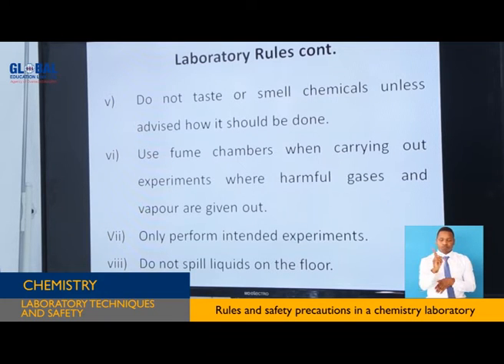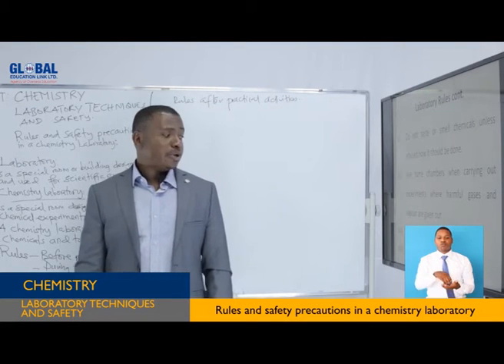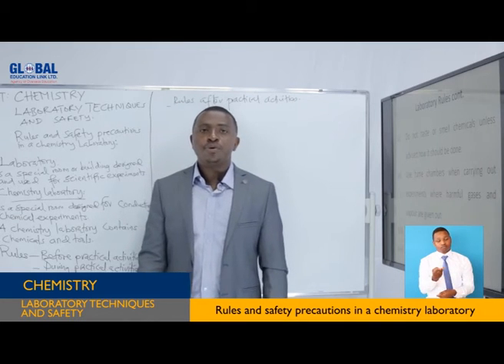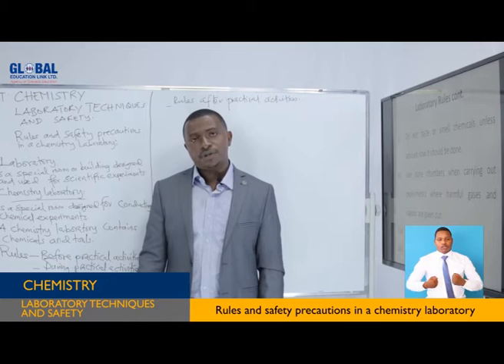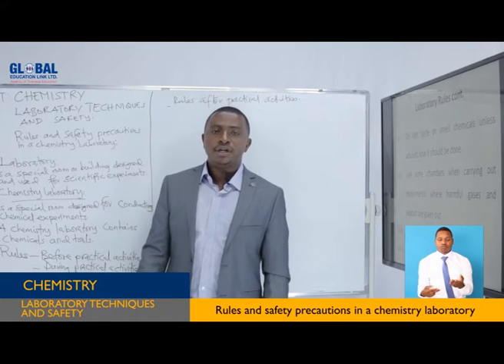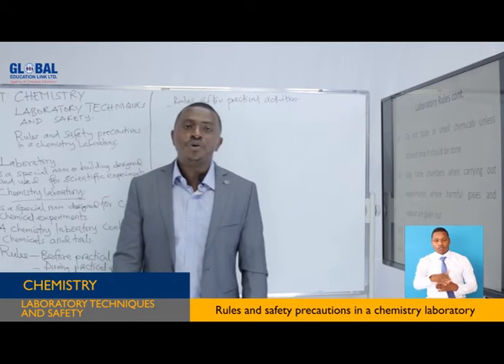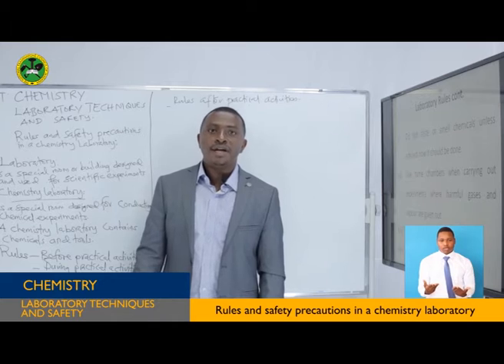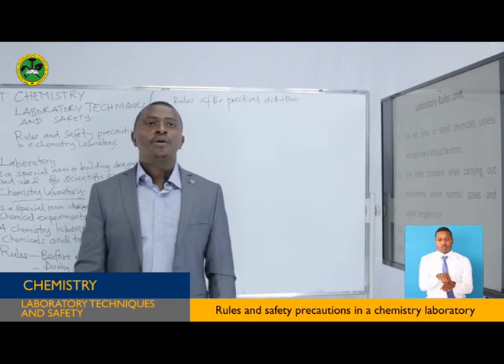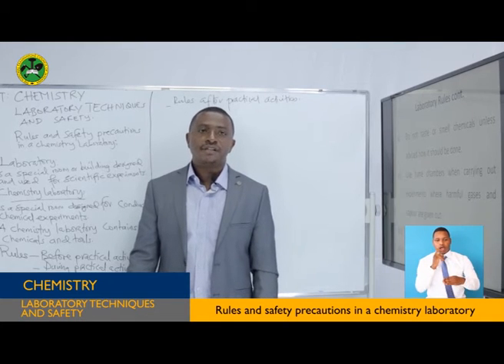This is also very important because spilled liquids on the floor can lead to accidents such as falls. Spilled liquids on the floor can lead to burns. Spilled liquids on the floor can lead to irritation or can put someone in a danger which is unnecessary.